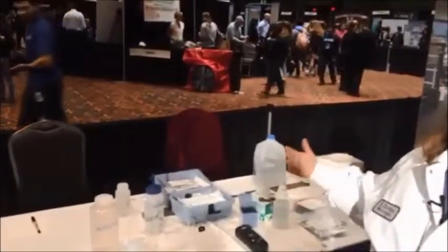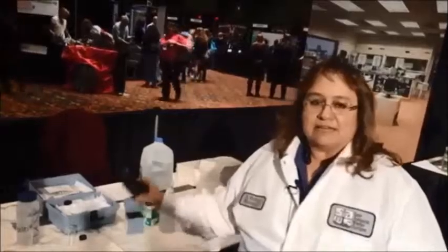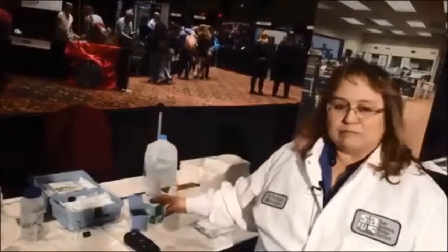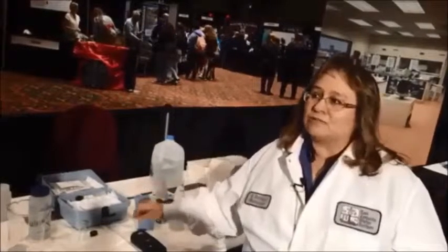And what is some of this back here? This over here is kind of both in the laboratory and what they do in the field. So when they bring a sample into us to test for bacteria, they have to do what's called a chlorine residual. And so we have a little Hach meter, a little handheld meter, and we made some solutions up, and so the kids will be able to actually test the water for chlorine residual. And so that's what we have over here.